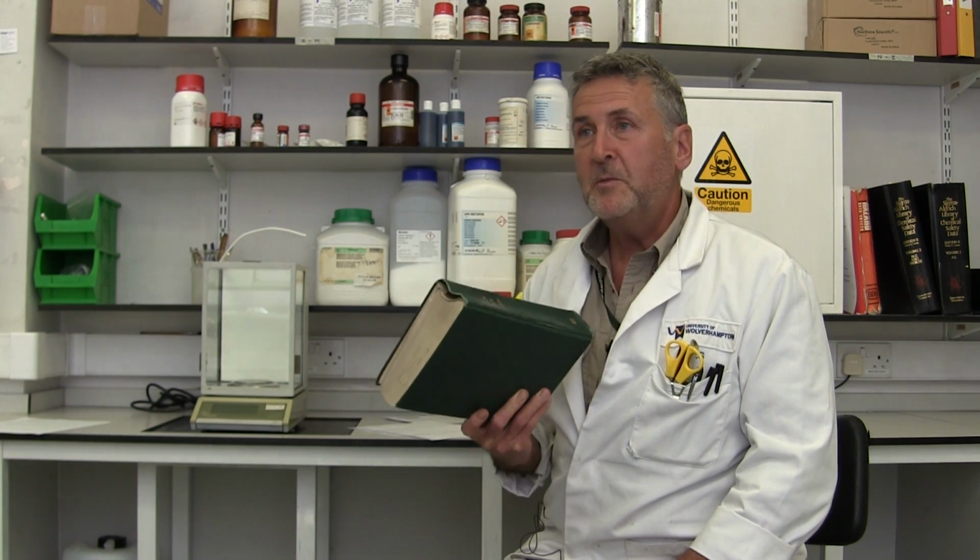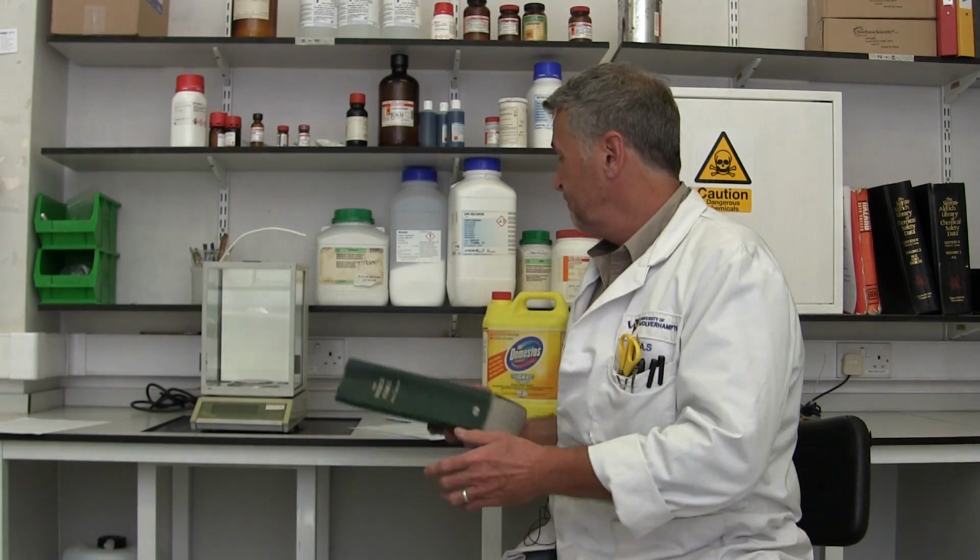I would guarantee that most places that work with chemicals have some form of Merck Index. It might be more up to date than this one. It might have all sorts of different handbooks that will tell you physical property information that you'll need to know. But make sure you do know the physical properties of your particular substance. Chances are it'll dissolve in water, but if it doesn't, it's an awful waste of time and money.